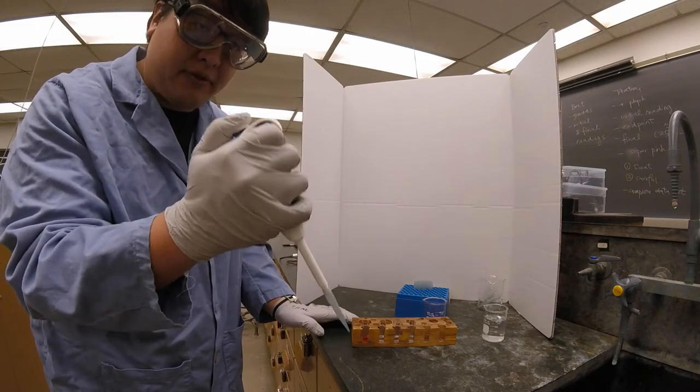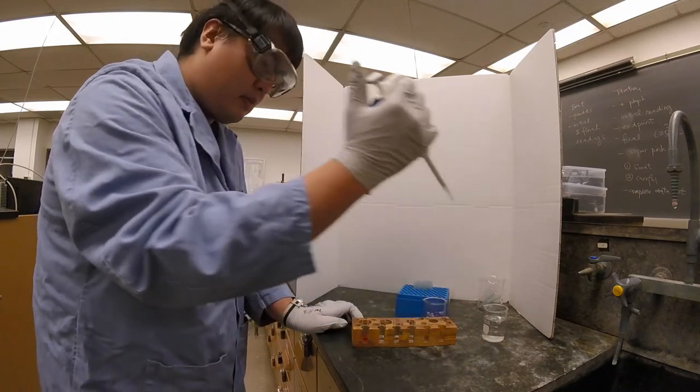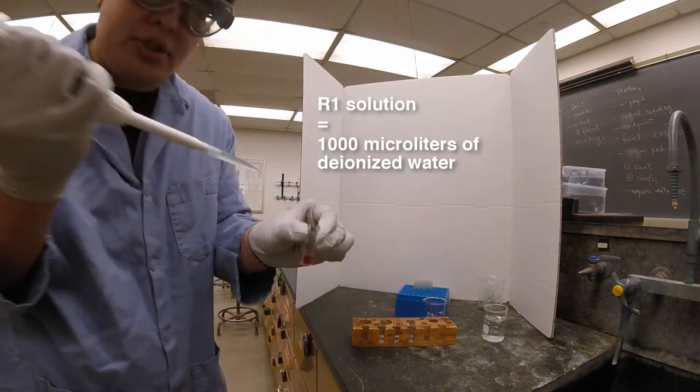So we're going to go down to the first stop, drop some water slowly, and then we're going to add it to R1.